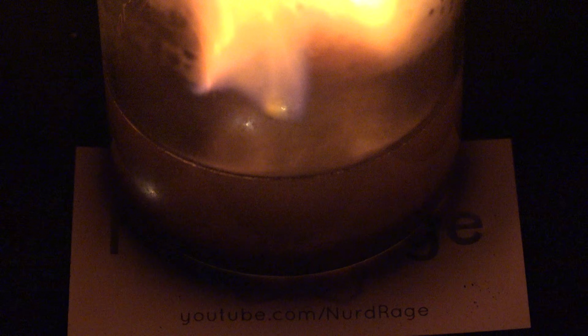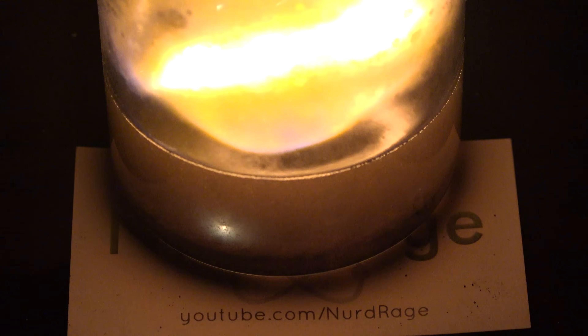I gave the fire safety warning at the beginning of the video, but I want to emphasize again that this reaction is dangerous. It can occasionally ignite itself, and in fact that did occur in a few of my runs — although granted many would say this is a feature and not a drawback. But I'll say it again: fire safety protocols must be in place.